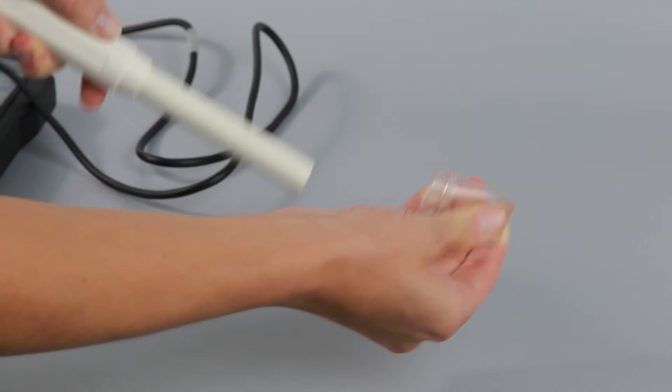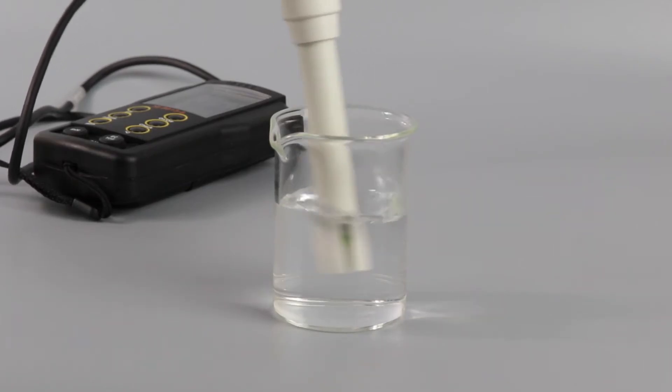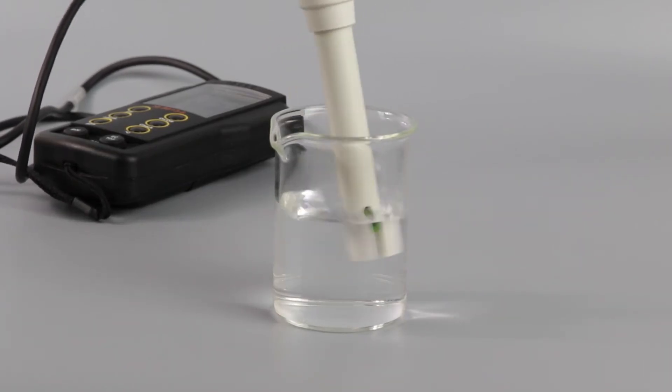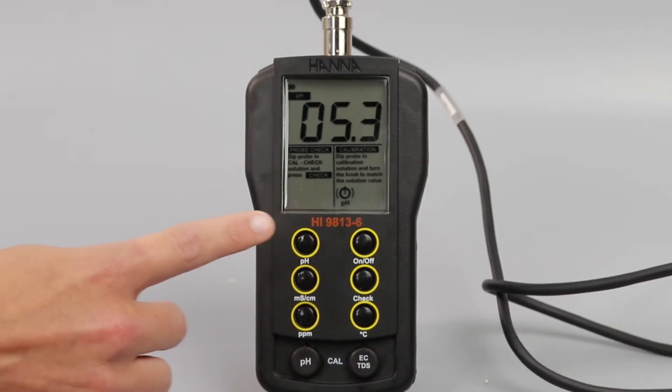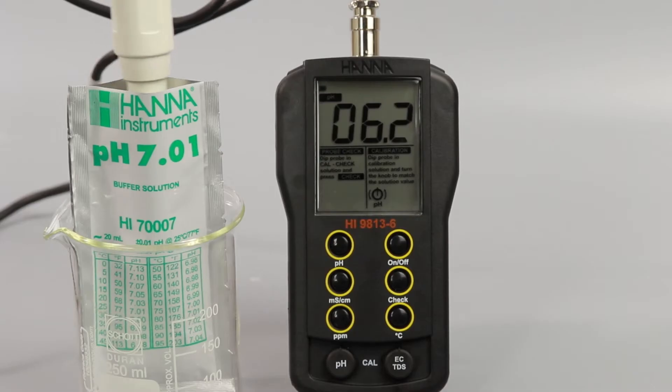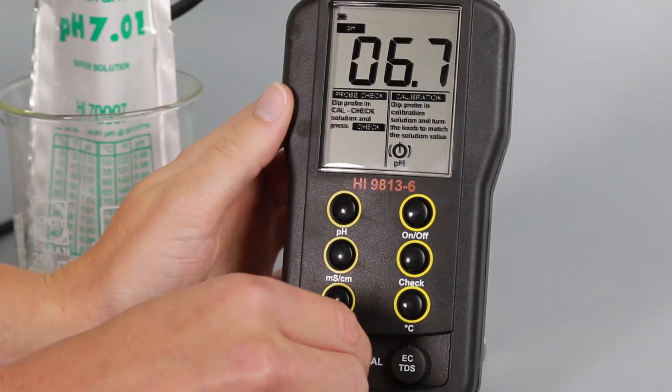To calibrate pH, remove the protective cap on the probe and rinse the tip with deionized water. If the meter isn't in pH mode already, press the pH button to get to the pH mode. Then place the probe into a sachet of buffer — we recommend pH 7.01. Once it stabilizes, adjust the pH calibration knob until it reads the value stated on the buffer package.